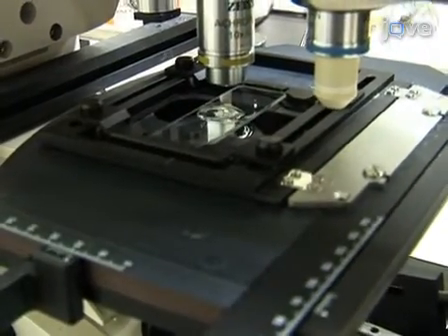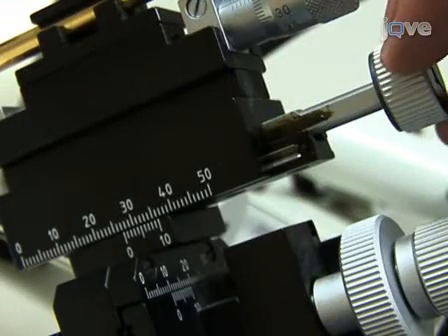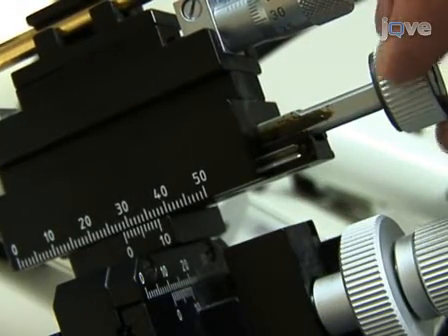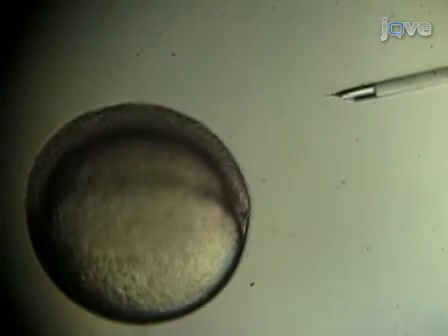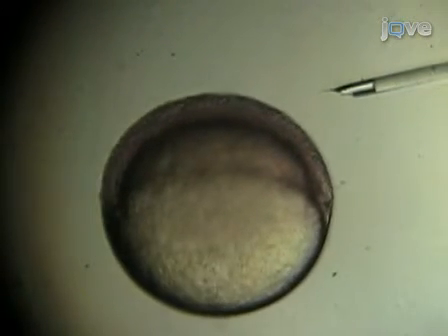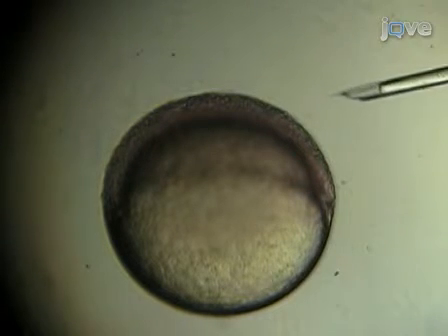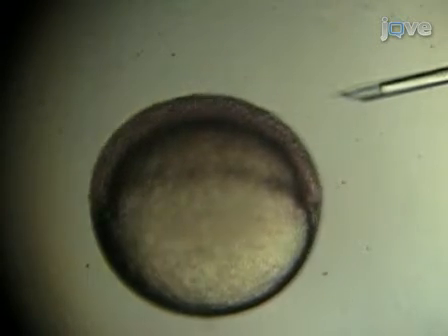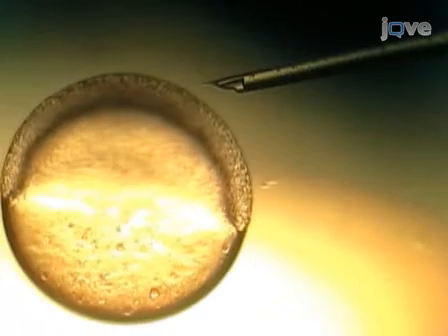Gastrula stage transplants are best performed on a fixed stage compound microscope. Use the controls of the micromanipulator to bring the tip of the transplantation needle into focus. Position the micropipette holder and needle at a fairly shallow angle so that the needle is as close to horizontal as the edge of the depression on the slide will allow. Next, pierce the donor embryo.